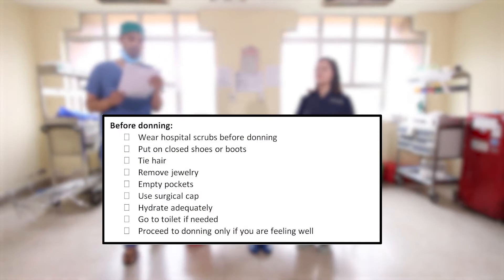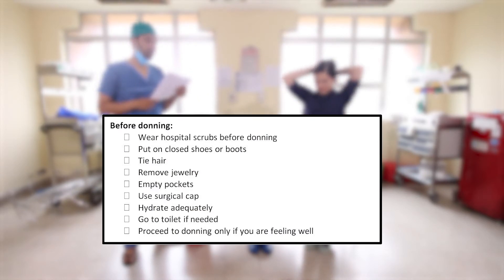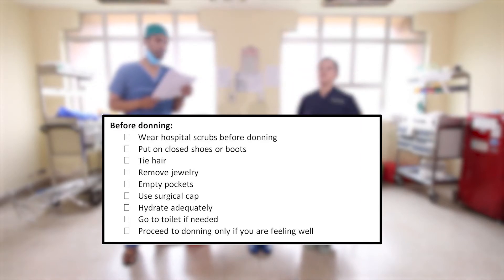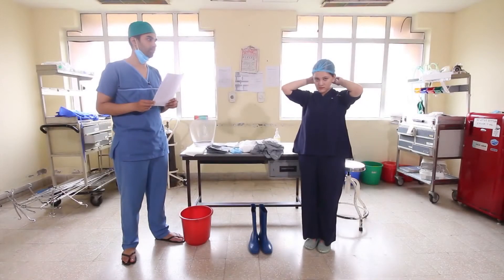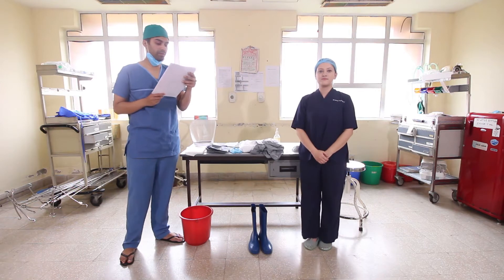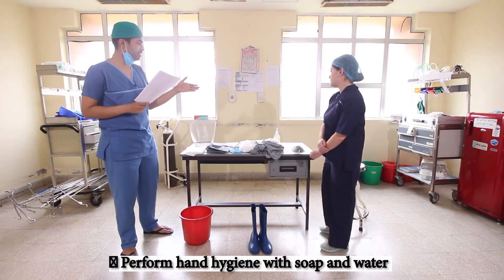Before donning, we are to wear the hospital scrub, put on closed shoes, tie the hair, remove all jewelry, empty pockets, and use a surgical cap. Hydrate adequately prior to this process and go to the toilet if necessary. After putting on the hospital scrub and surgical cap, move forward to the donning area and first perform hand hygiene with soap and water and sanitizer.